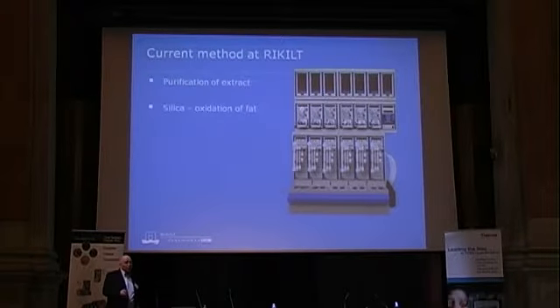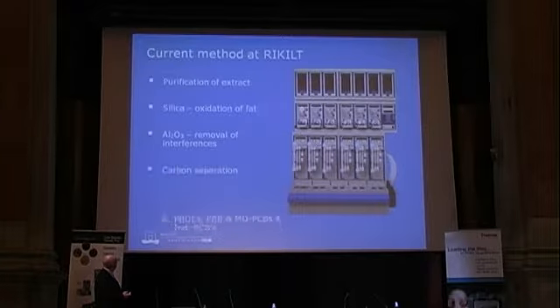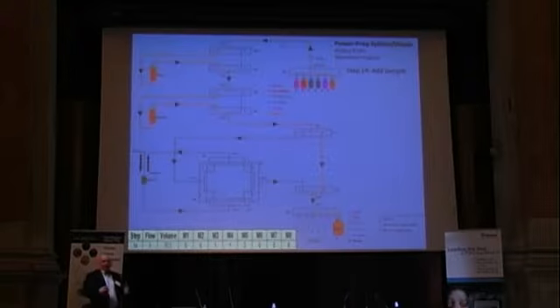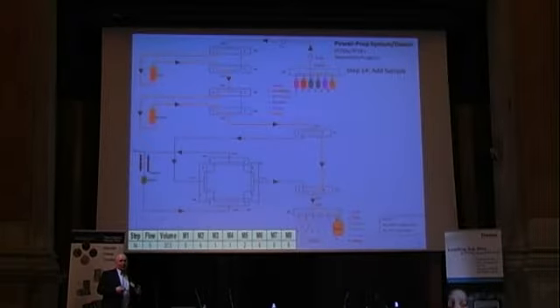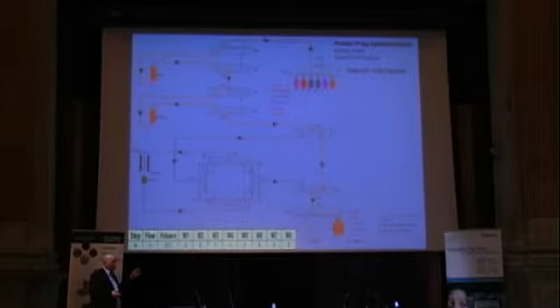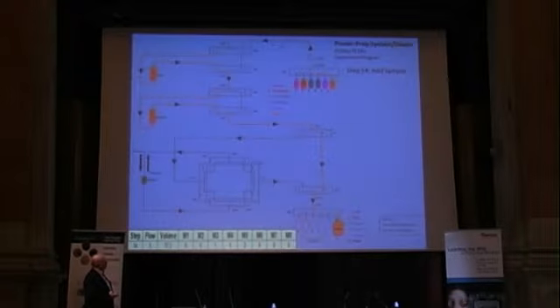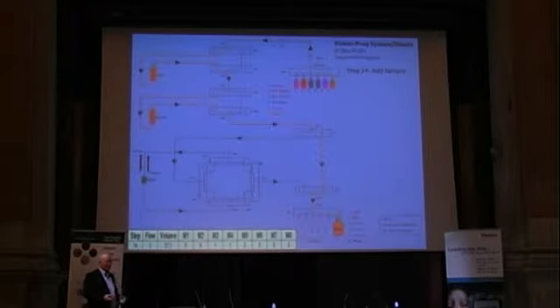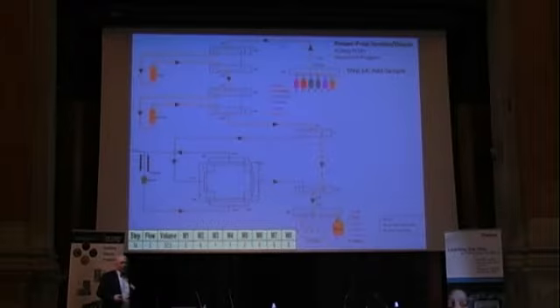It has been explained by Jeff this morning already, but this is the scheme, and actually it's a brilliant system, and the brilliance is in its simplicity. It's 2 six-way valves and a number of 2-way valves. By switching them to one position, you can decide whether the solvent goes to the column or bypasses the column. It's very straightforward, and it takes 24 steps to get your 2 fractions containing the compounds of interest. The programming is very easy. Jeff showed a whole paper of these things, but it's very convenient.